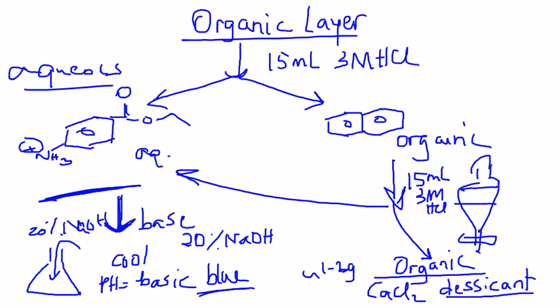You're going to then decant. When I use the word decant, that basically means that you're going to transfer only the liquid part; the solid will remain. You're going to decant it into the round bottom flask, and then you're going to queue up for the rotary evaporation and evaporate off the liquid. What will remain behind is your product. Let's take a look at the schematic of this step as well.